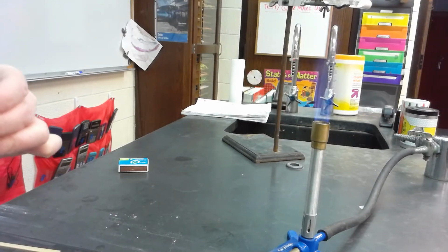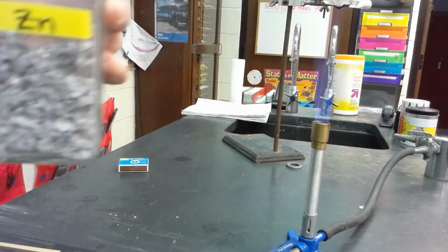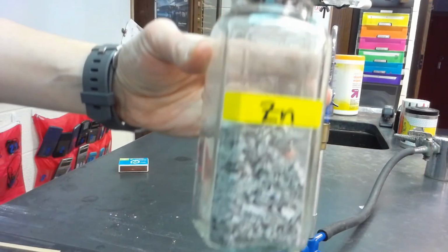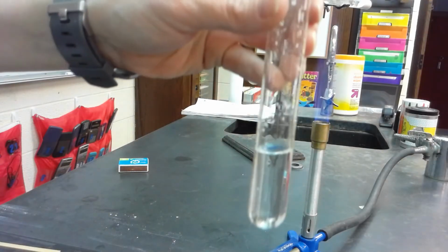Okay, and then we have mossy zinc. Mossy zinc is just little chunks of zinc. They look like this. I tried to pick out a bigger piece so that we get a really good test. So, come on camera, there it is. So here's our test tube. It's got acid in it.